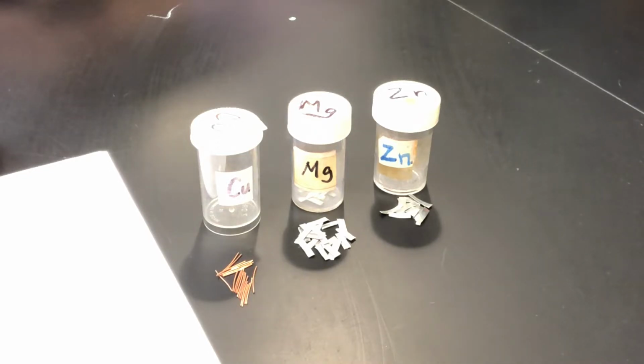Silver is pretty expensive, so if we had silver, high quality, pure form, we would not be randomly just reacting with other things to see if it does. That would just be something that would cost too much money. Because today we're focusing on the activity of different metals. So who is more reactive than the other?